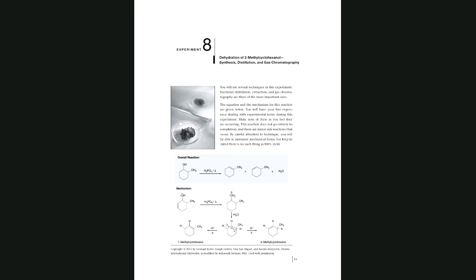Okay. Anything missing from the setup? Can you see if anything is missing from the setup? Nothing is missing? No?